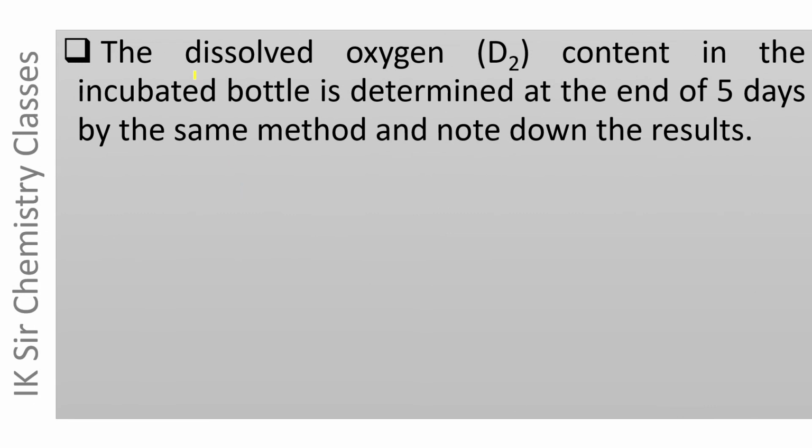The dissolved oxygen D2 content in the incubated bottle after the end of 5 days is determined with the help of the same method, and the results of the two experiments are noted down.